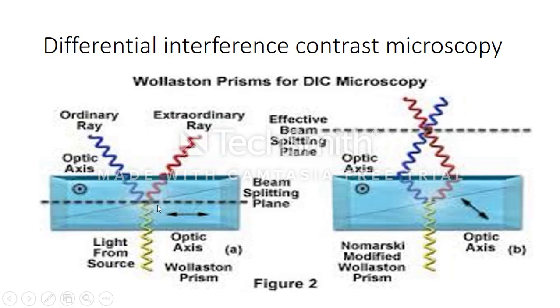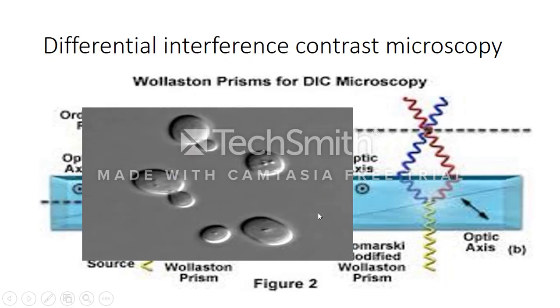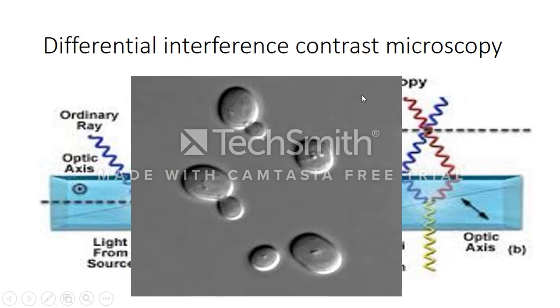What this polarizer can do is it can take out the vertical aspect, and all you have is a horizontal aspect coming through. And this allows for better contrast. It provides a better view of the cell, and it gives a better view of the periphery of the cell. So an example here would be this here. This is an image from it, and it shows a kind of topographical view, and it's very easy to see, and it works well.